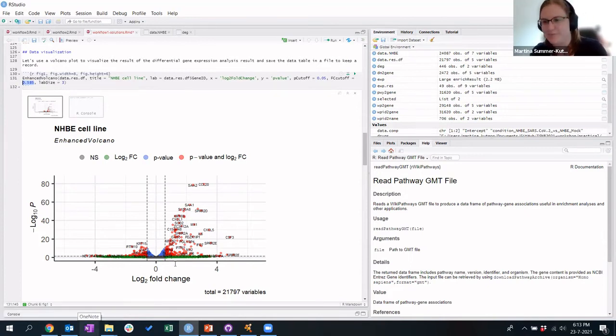So you have different possibilities, let's say like this. So there's also quite some genes that are strongly changed, but not significant. And that's because we only have 3 samples, right? So there's a significance issue as well.